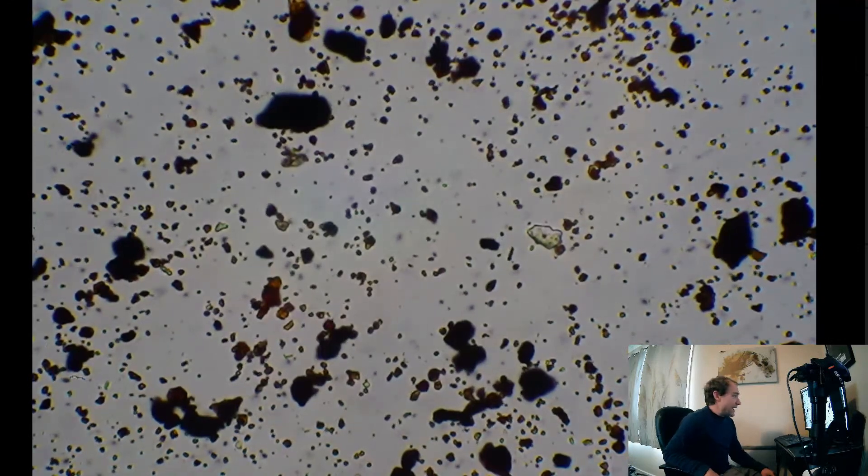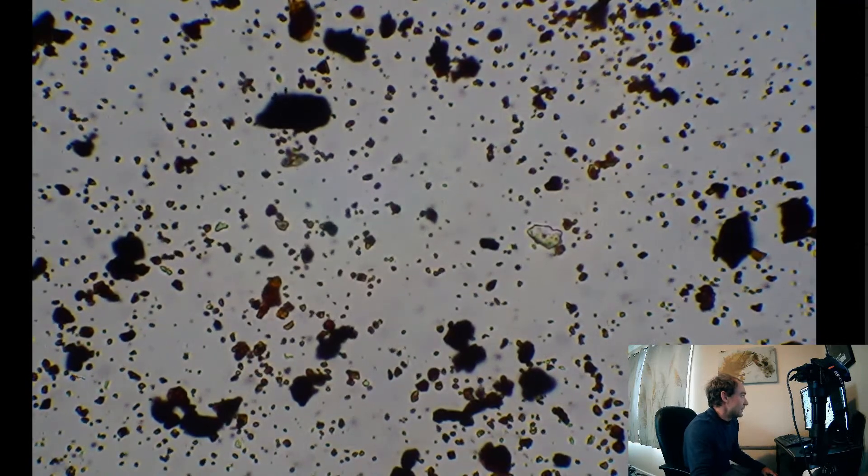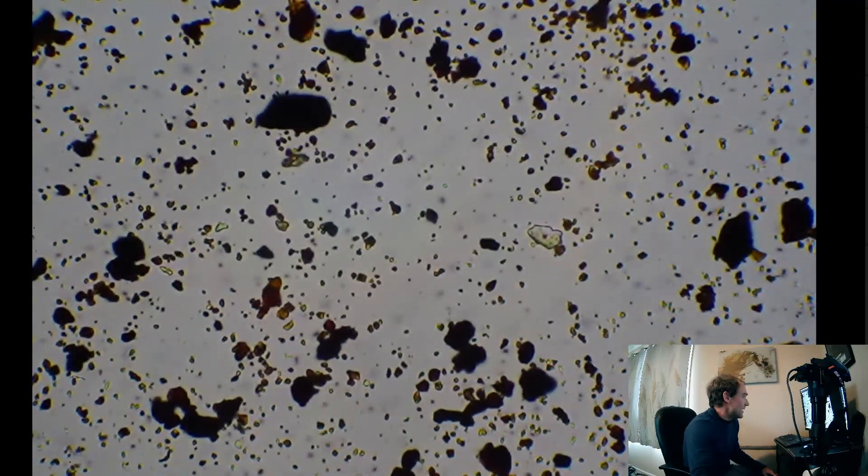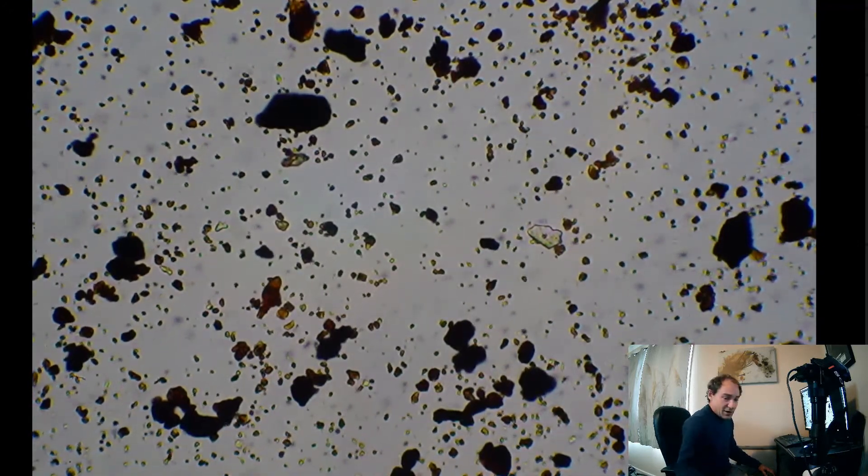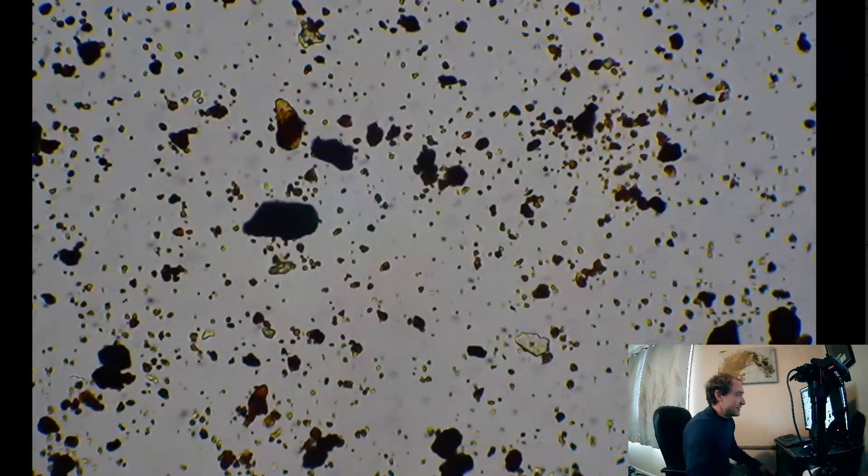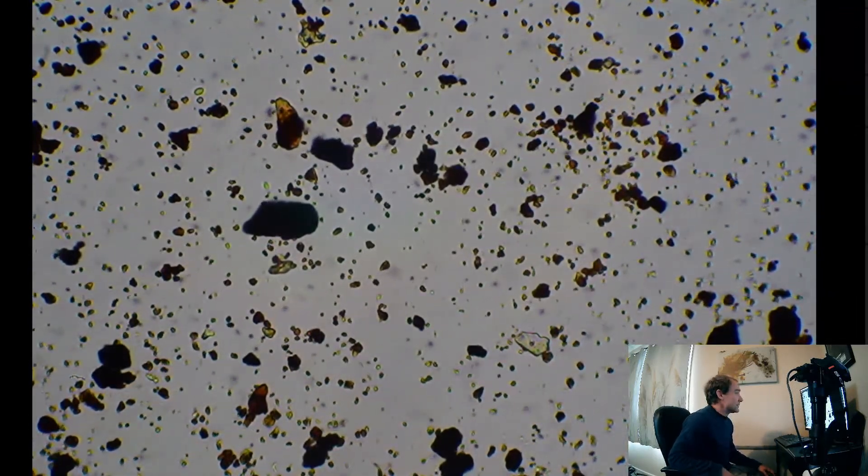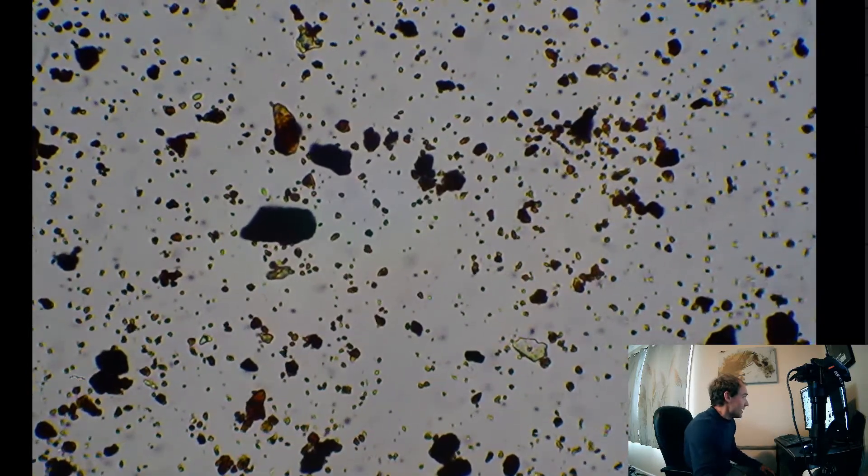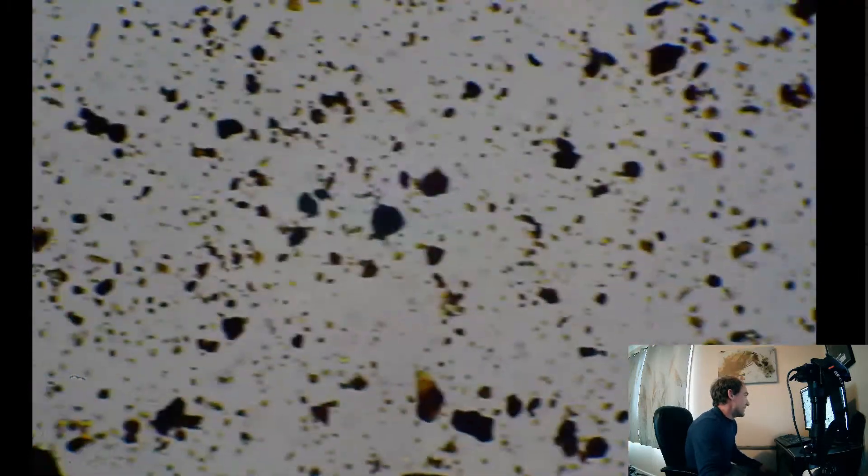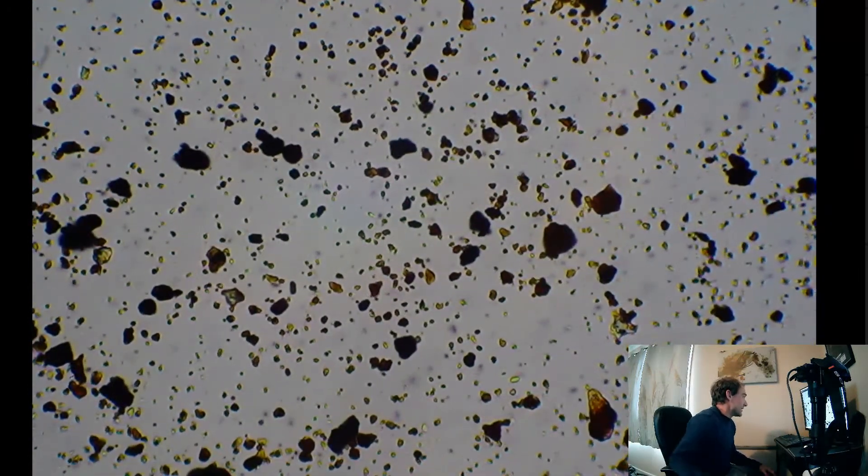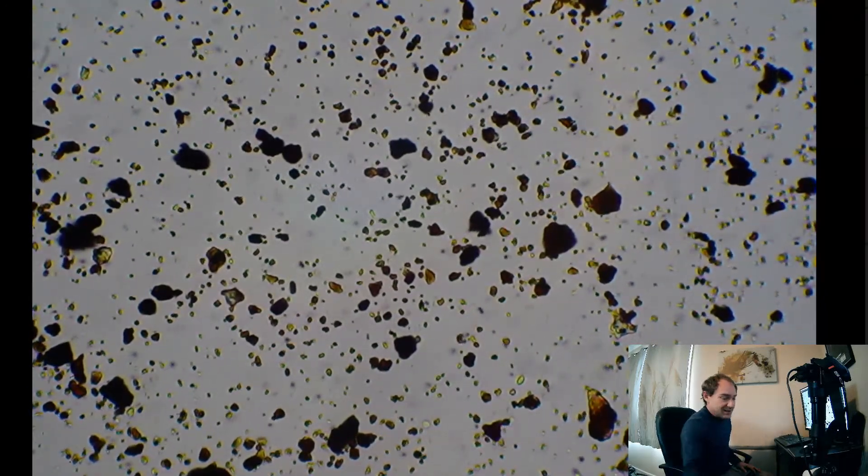Waiting for things to slow down here a little bit, but I'm seeing a lot of stuff wiggling around. We see quite a bit of life in here, which I'm very surprised to see because it's supposed to add food for your indigenous microorganisms already in your soil, but we're seeing quite a bit of life. It's not only adding food for your microbes, looks like it's actually adding some microbes too.